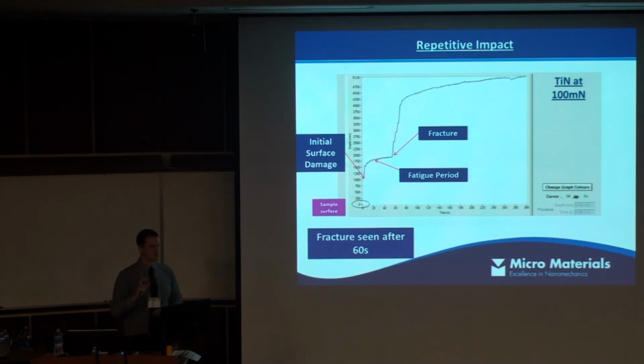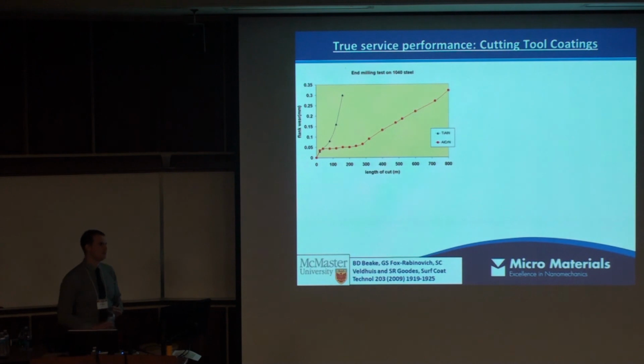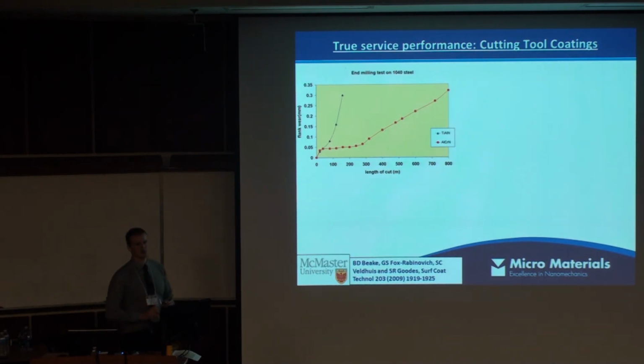So this is a very interesting test, but on its own it doesn't really give us much useful information unless you can use it in some way to relate to other more conventional type tests in order to allow you to establish performance for different real-world applications.